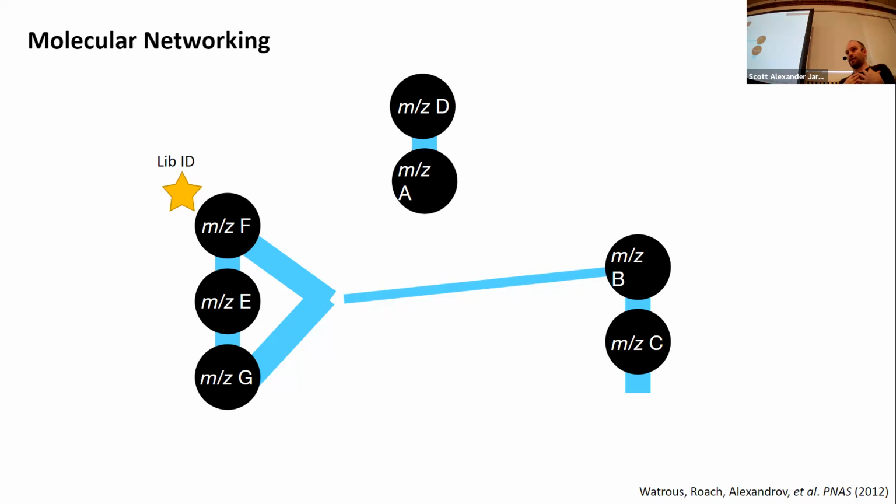And this, for me as an analytical chemist or natural product chemist, is very powerful because I see the delta mass between them. I eventually look at the structure, and we see these reoccurring mass patterns, like 14, right, for a methyl group. And I can then say, okay, perhaps there's a methylation. And if I have a hydroxy group somewhere, and I know that in my gene cluster there might be a methyltransferase, then it's very easy and straightforward to build up this hypothesis.